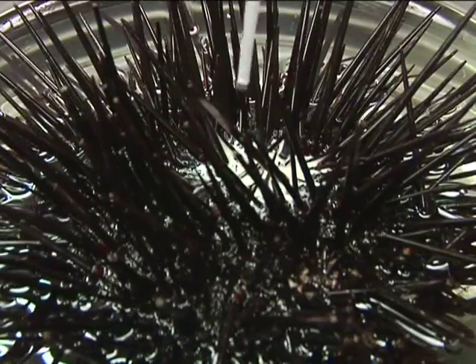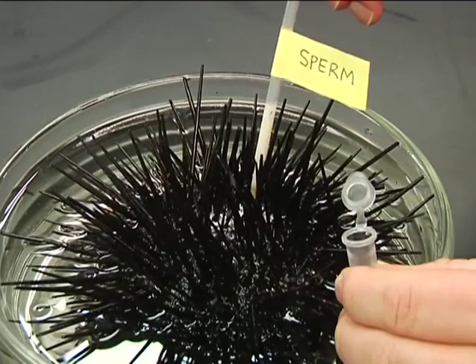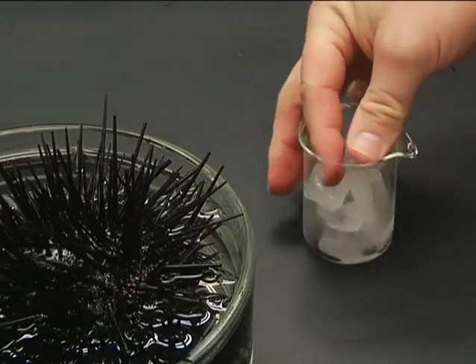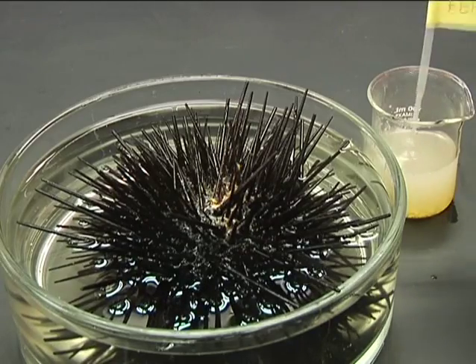If your urchin is a male, a white fluid will be released on top. Remove this sperm and store it on ice. Eggs are golden yellow and they should be placed in a beaker of clean seawater.